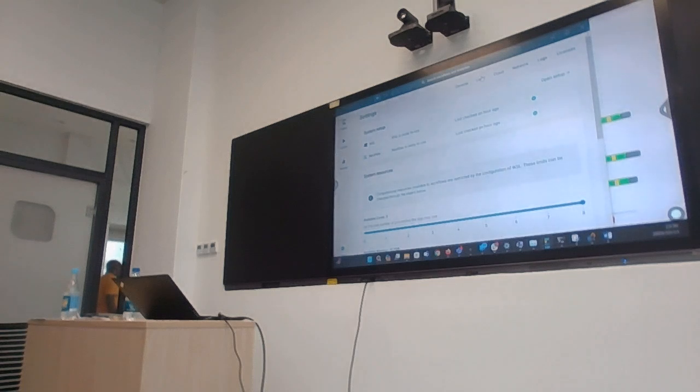WSL, which is effectively a virtual machine system, right? And Epi2Me runs a specific virtual machine called Epi2. You're going to need that terminal access. So, yeah, okay, good.